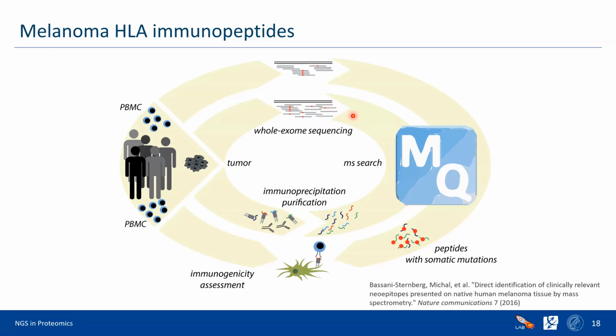So as a result, we're finding that a subset of these mutations are going to be non-synonymous, and we're including actually all mutations which we find into the search. And lately, we are checking which non-synonymous mutations are tumor specific, and we're using exactly those mutations and peptides for further studies.